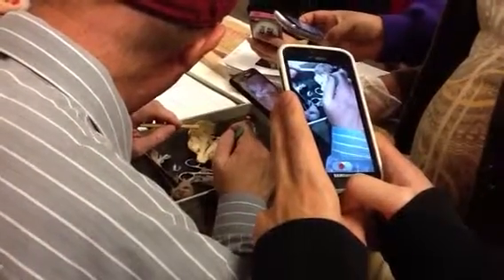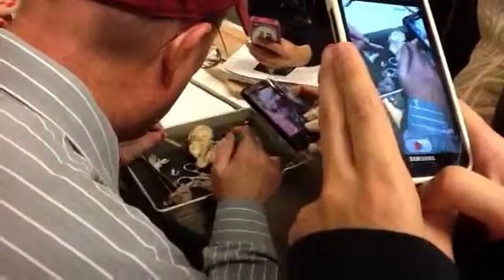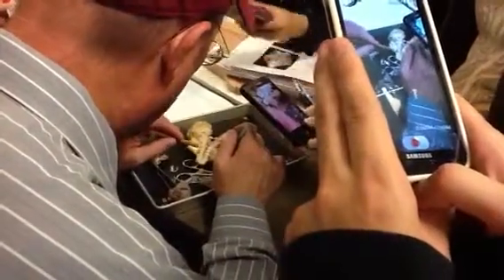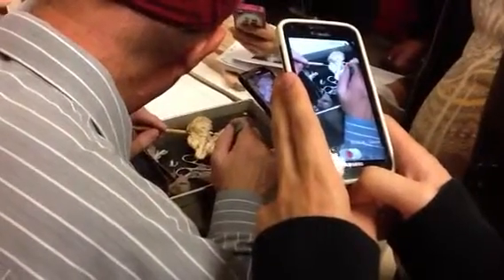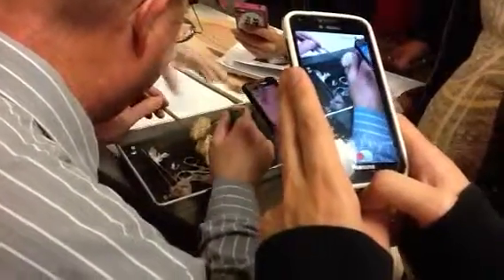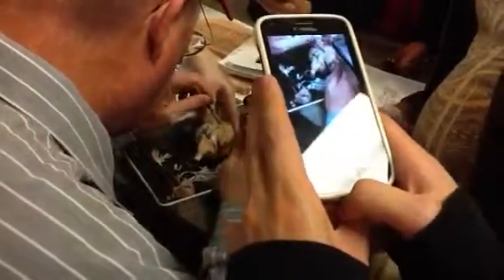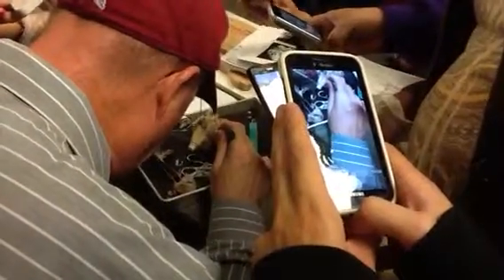Okay, the cerebellum is this thing here. The arbor vitae is the white matter. It's like a tree. Tree of life. Let's see, the brain stem, the medulla oblongata. Let's turn this thing over. Medulla oblongata is this thing right here.